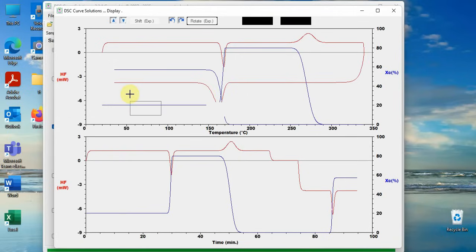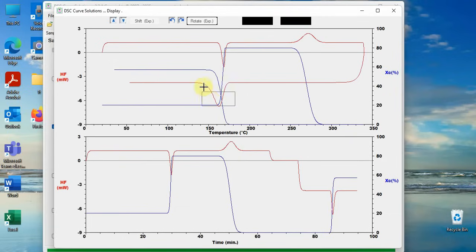The blue curve is for crystallinity. It starts with 20%, increases to 80% due to crystallization, melts to zero, recrystallizes to 58%.